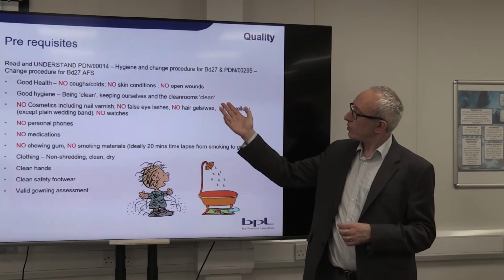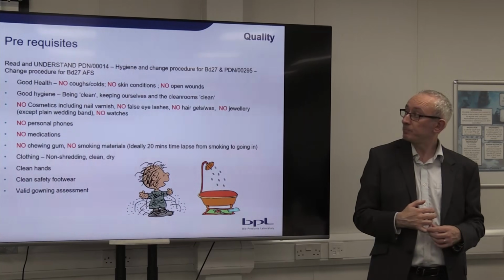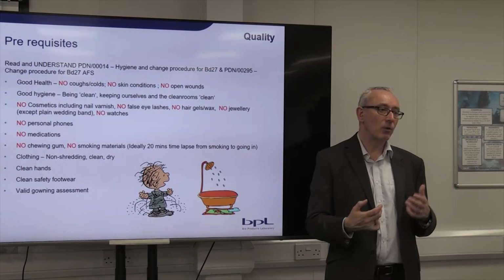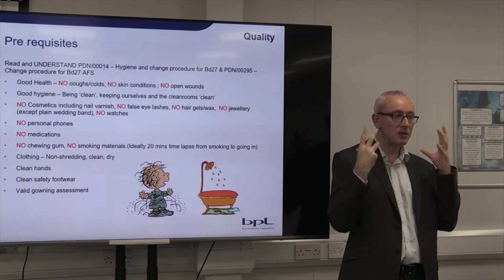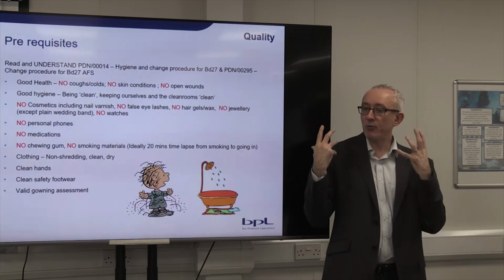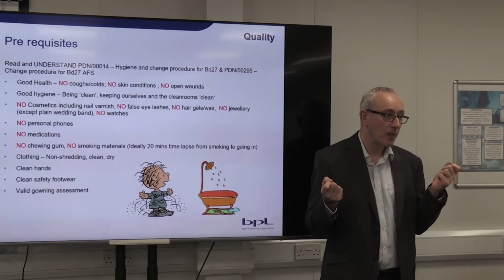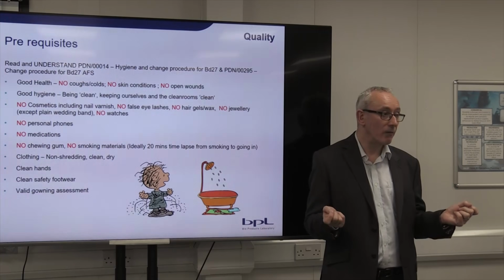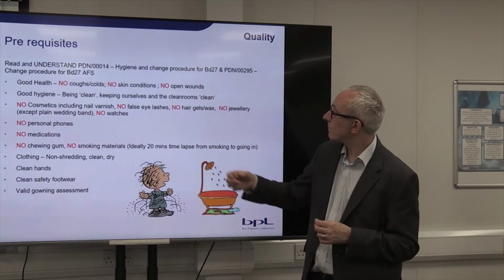So it's very important that nobody goes into a clean room if they're feeling unwell. And by unwell, that means no coughs or colds. If you have a cough or a cold, then the ability of the mask to contain contamination will decrease. So we know that for a healthy person, you can wear a mask for 4 hours. If you have a cold, then the ability for that mask will drop down to about half an hour. So it's just not any good because of the amount of moisture that you're producing.